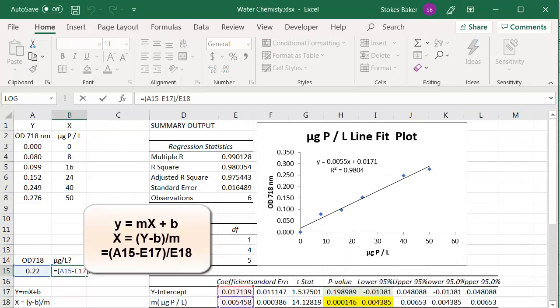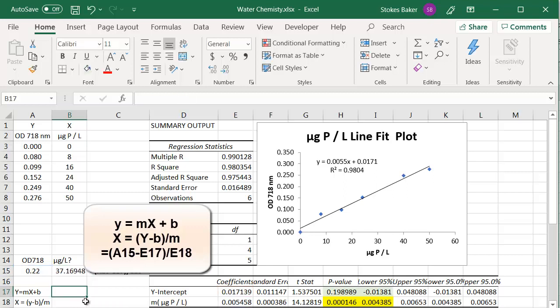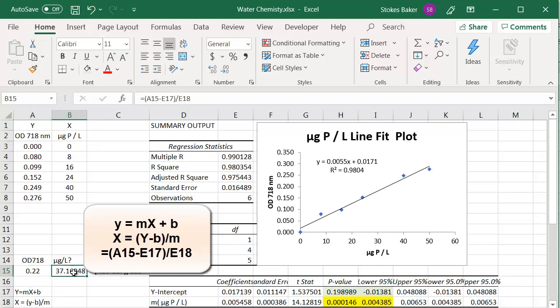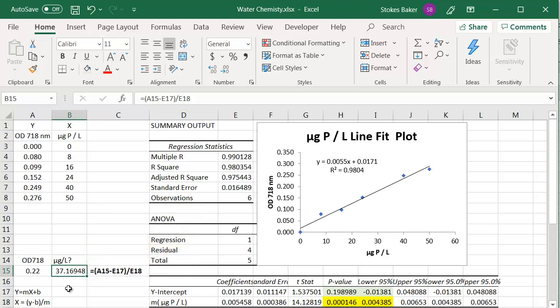And I'm showing you right here the equation I used and the corresponding value. So since our water sample produced an optical density of 0.22, that means the water sample had a phosphorus concentration of 37.2 micrograms of phosphate per liter. I hope this was helpful. Have a good day.